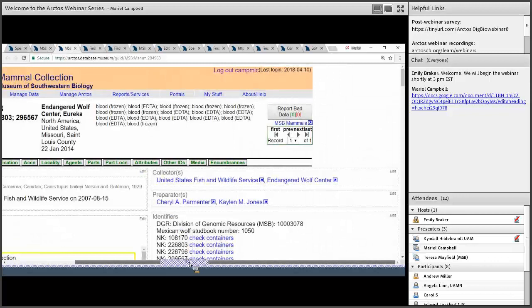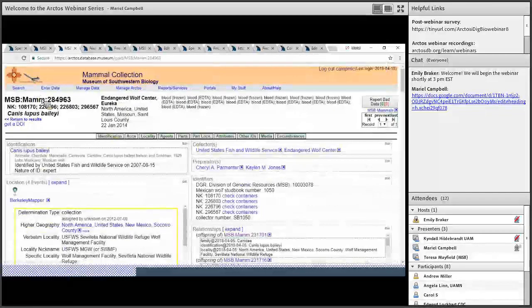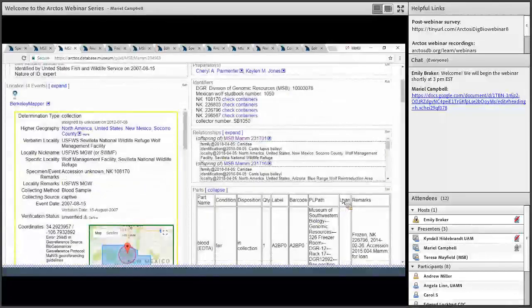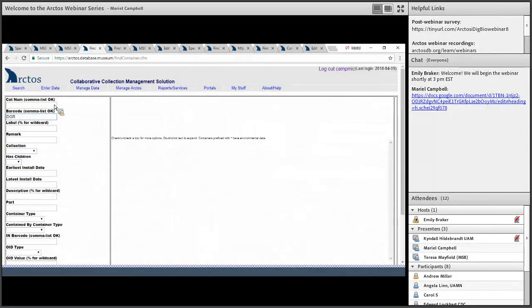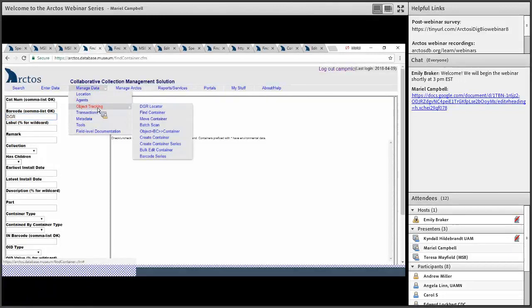We use a barcode or a label as a way to integrate the object tracking system in Arctos with the catalogued system. You get to the object tracking interface through the Manage Data Portal — you have to have permissions for access. Under Object Tracking you have tools including Find Container, Move Container, and Batch Scan. This is the Find Container screen, and I put in a barcode for my division — the Division of Genomic Resources at the Museum of Southwestern Biology.